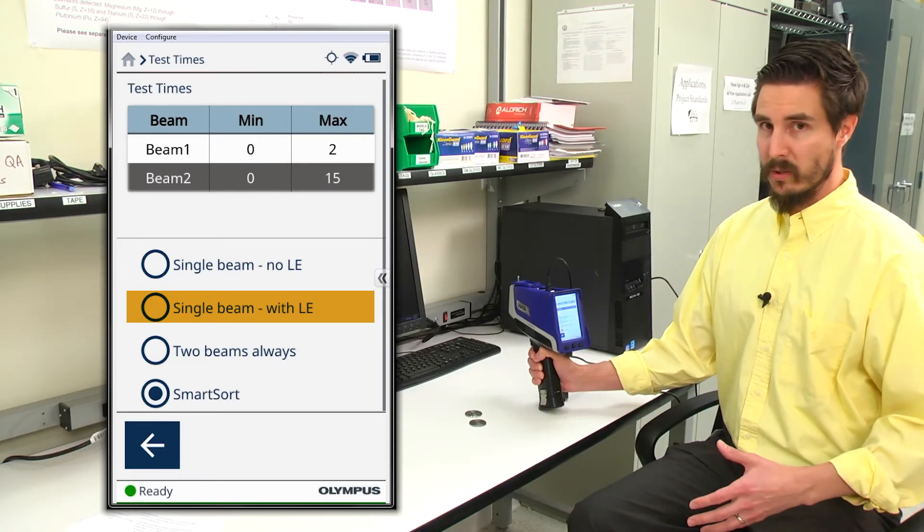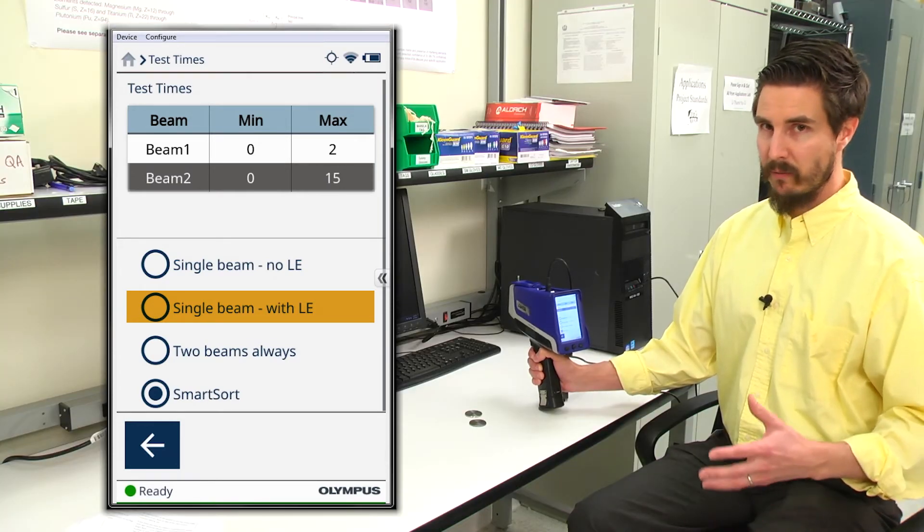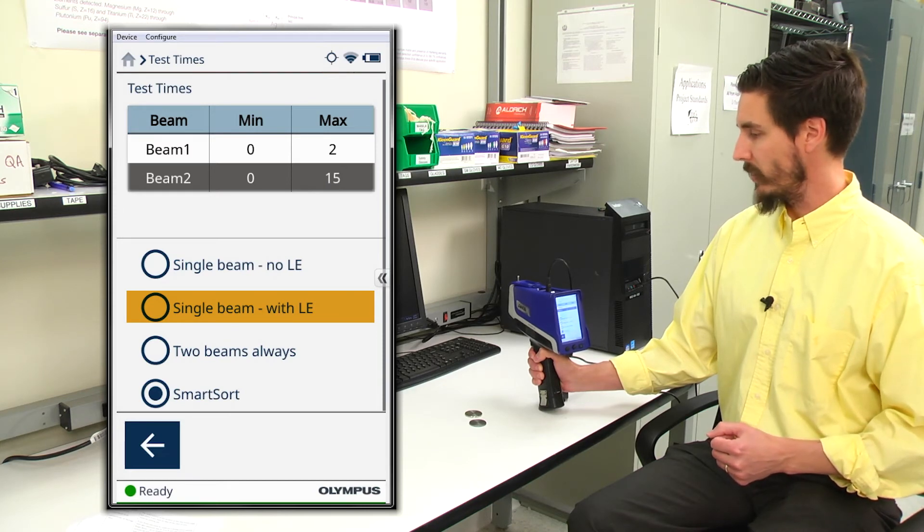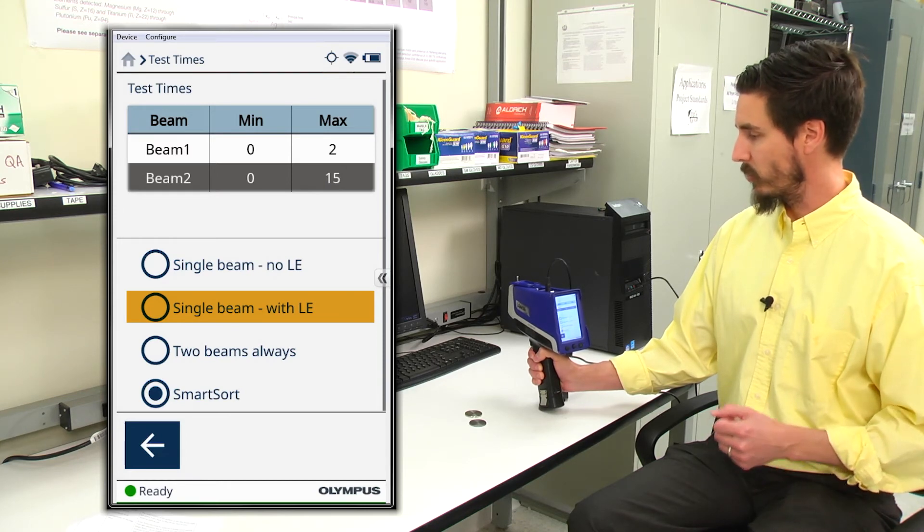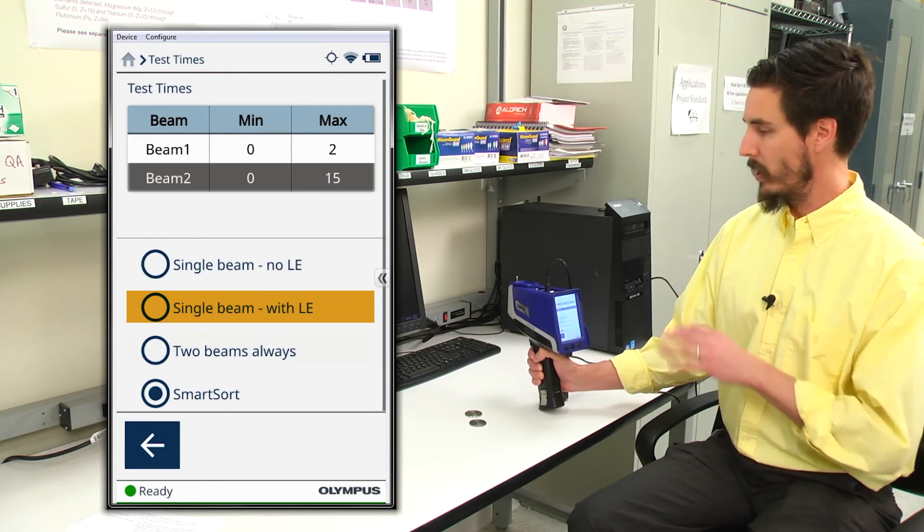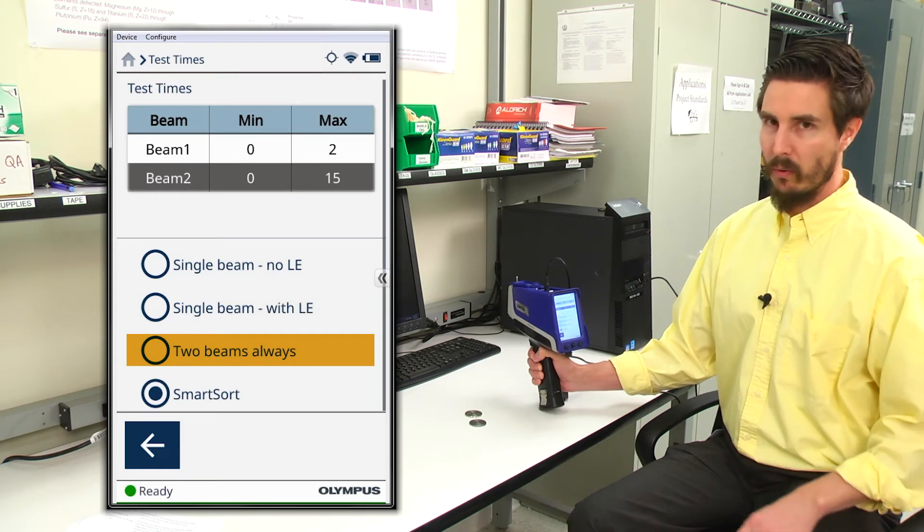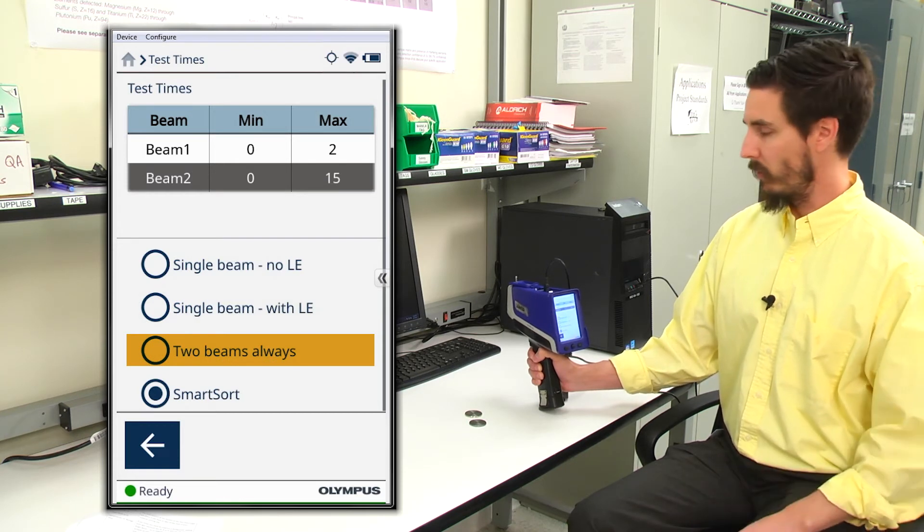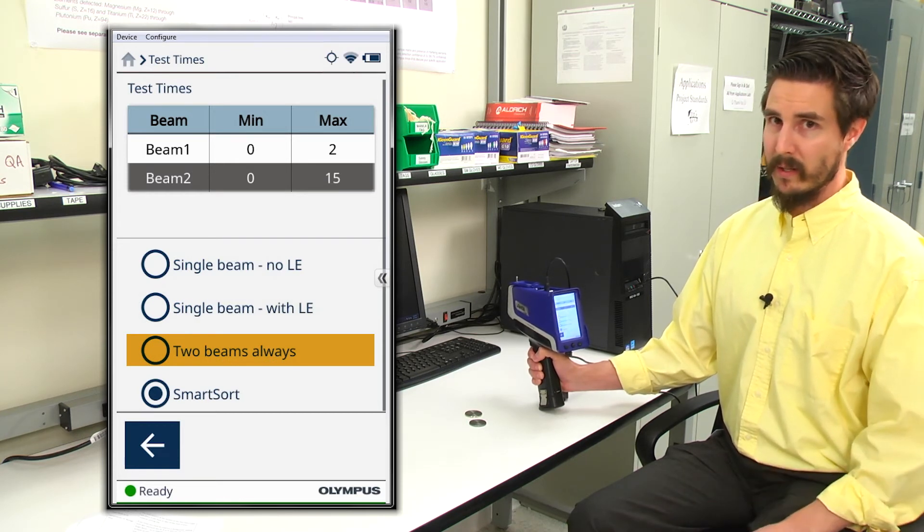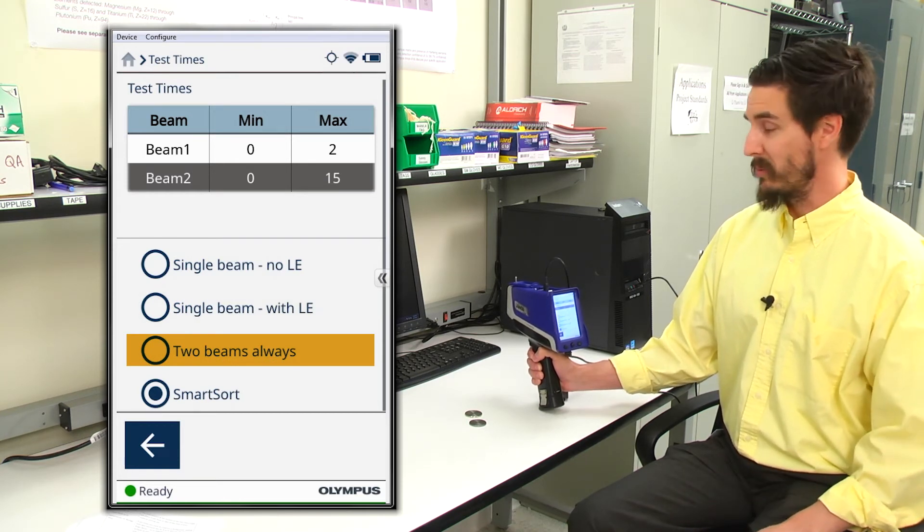If you're looking to have as much information as you can about your alloy test, as you can possibly get out of the analyzer, two beams always is the way to go for you. And as the name implies, it uses two beams always.